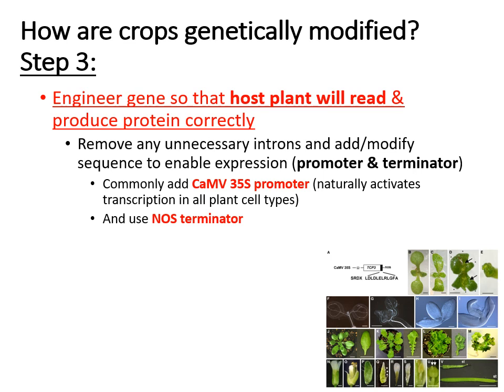That's significant. I want you to circle, star, highlight the fact that these two sequences are in the majority of GMO crops that we make. That's significant for our experiment today because that means that we can specifically target and identify whether a particular plant contains these two sequences.